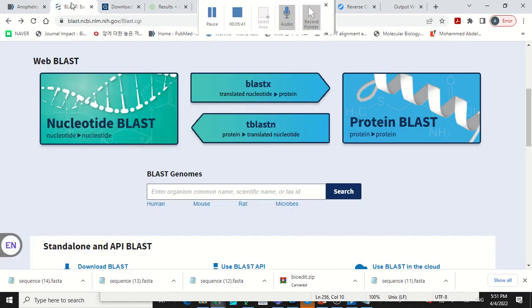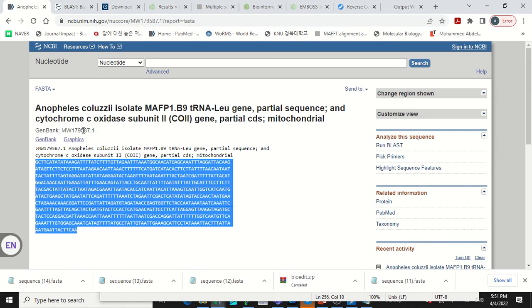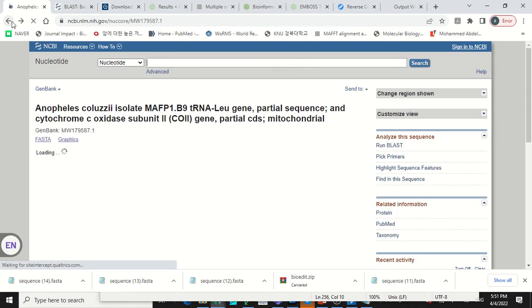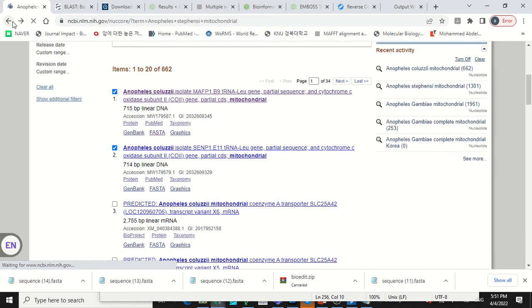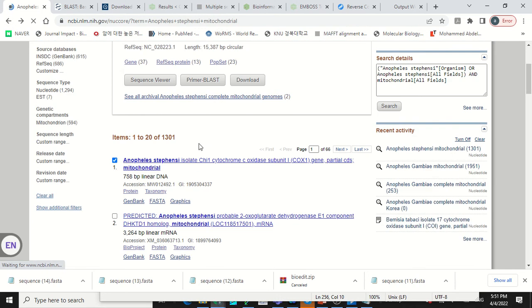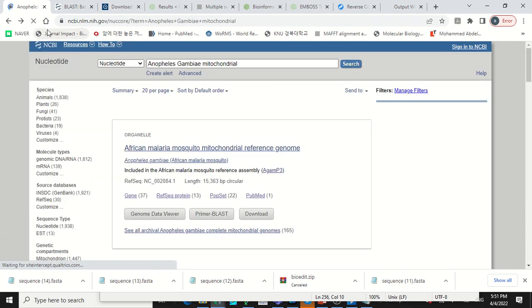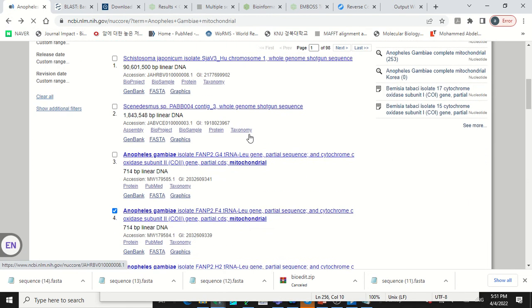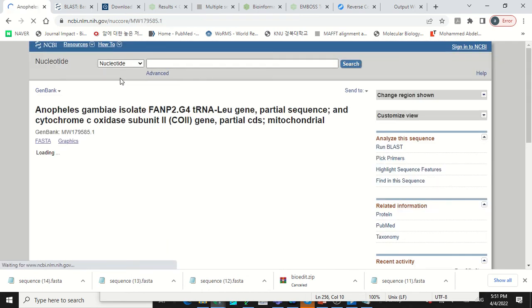So let me try and see, if it's not going to take us time, another sequence that is much more accurate. I'm not sure we can have one any time soon, but it is good for you to use that. Okay, let's try this, but I'm not sure it's going to work out.